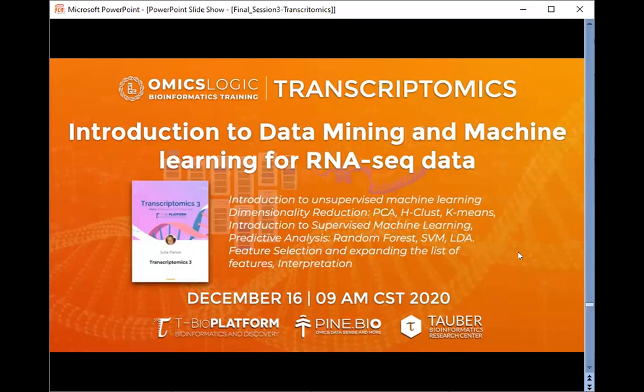Which type of normalization is recommended if I have more than one run file? Exactly, Mark, can you explain run file? Okay, so if you have data from the same study or the same experiments, then we can usually apply quantile normalization if we have already normalized FPKM or RPKM values.